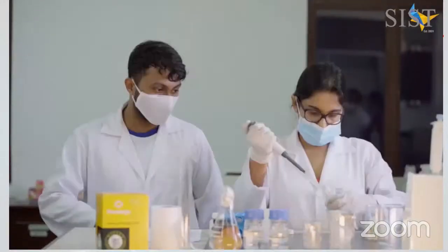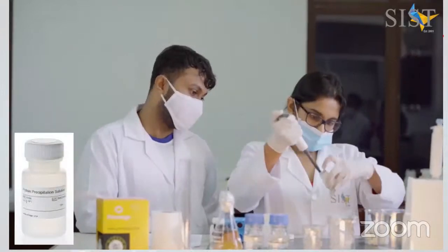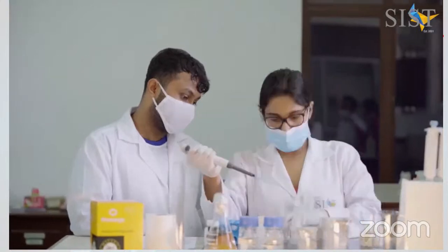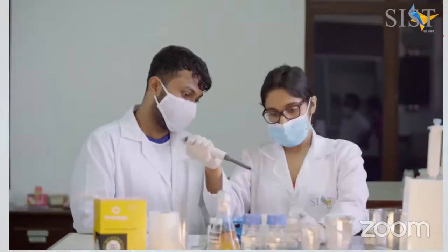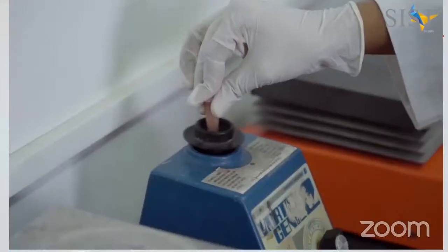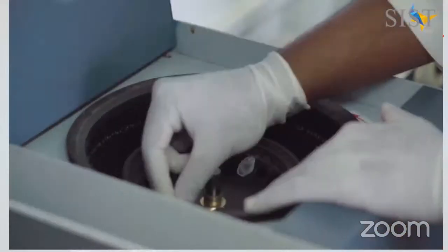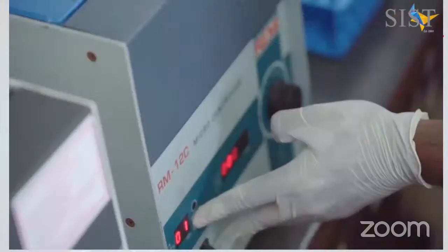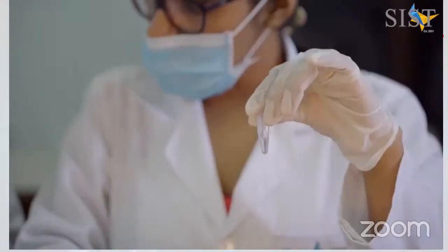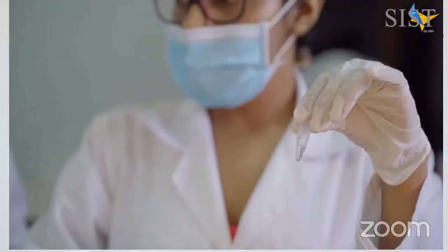Following this, protein precipitation solution is added to precipitate the proteins. When this is added, you will clearly see the protein clumping that takes place, and upon a vigorous vortexing step, you will then centrifuge the contents to obtain the protein pellet. Meanwhile, to a fresh tube, you have to add isopropanol and be prepared for the next step.